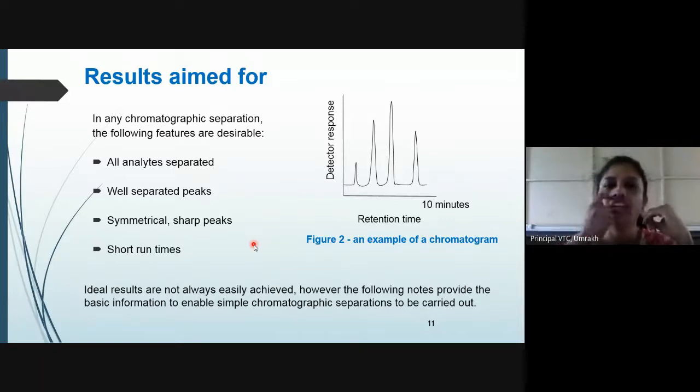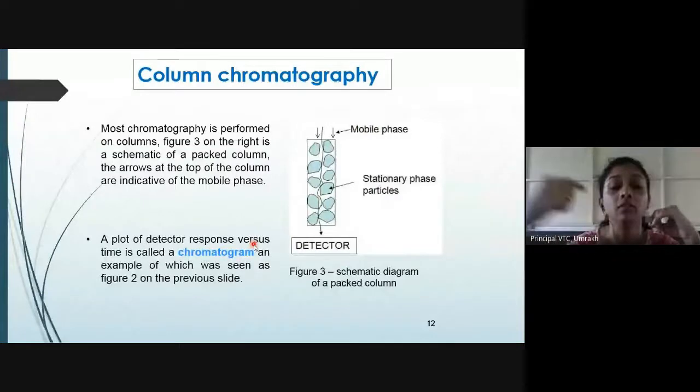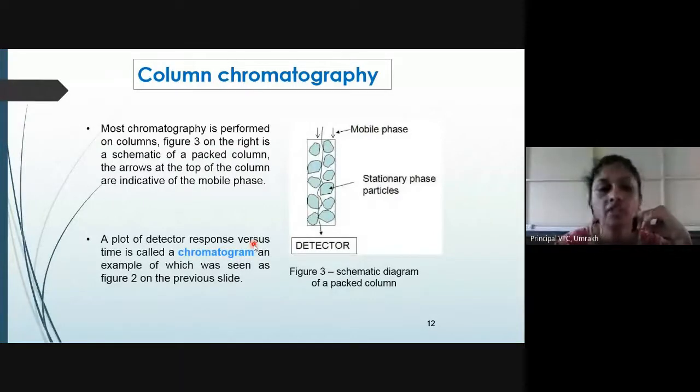Now, for today's lecture, I will be further discussing different kinds of chromatography, like column chromatography, paper chromatography, size exclusion chromatography, and supercritical fluid chromatography. These are the different chromatographic techniques used, which are the different modes of chromatography.